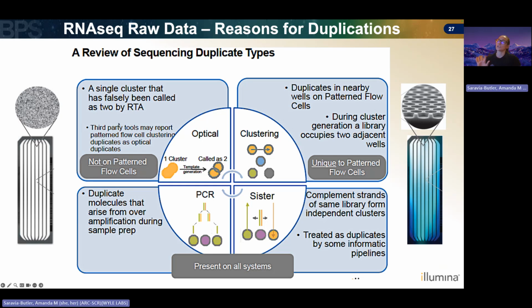One of them here, there are two different types of flow cells for Illumina sequencing. There is unpatterned and patterned flow cells. Unpatterned flow cells are those that you saw in that Illumina sequencing video at the end of the last lecture of the GL4U intro module set, where the clusters are not separated by a barrier on the flow cell. There's just a lawn of those P5, P7 complement regions.